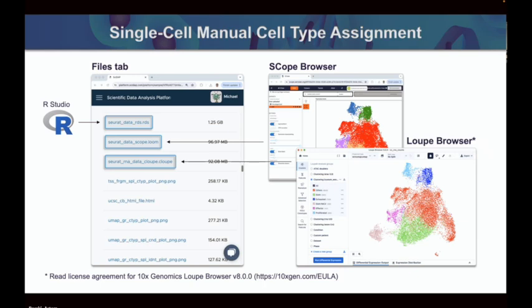Do you have ways to export, or connections so you could load your data into the UCSC Genome Browser? We are making bigWig files, but for the genome browser, we have a built-in IGV. Could you have the UCSC browser built in too? That's probably harder to do. It's harder to do. It's not licensing, it's open source. In our previous platform, we had UCSC, but it was a lot of work to maintain. Okay, fair enough.